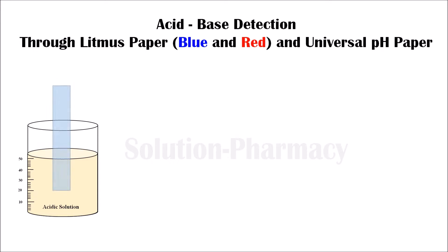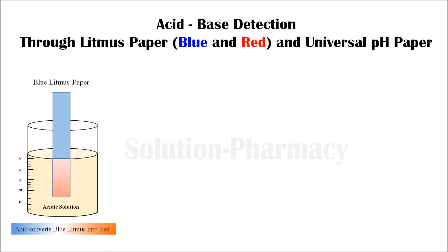When we dip blue litmus paper into this acidic solution, this blue litmus paper converts into red. Here you can see the blue litmus paper changes to red, which confirms that our solution is acidic in nature, because acid converts blue litmus to red. When we dip red litmus paper into this acidic solution, no change takes place.